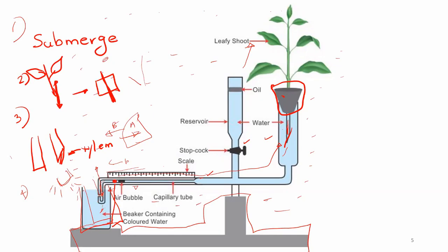The beaker will have the water, and if possible, we can go for colored water also for clear observation.